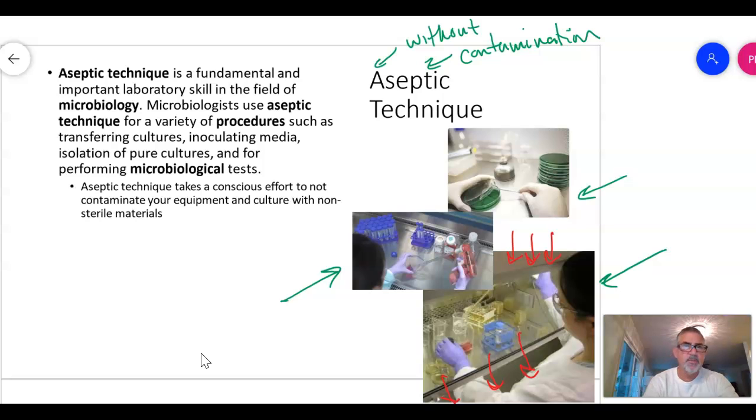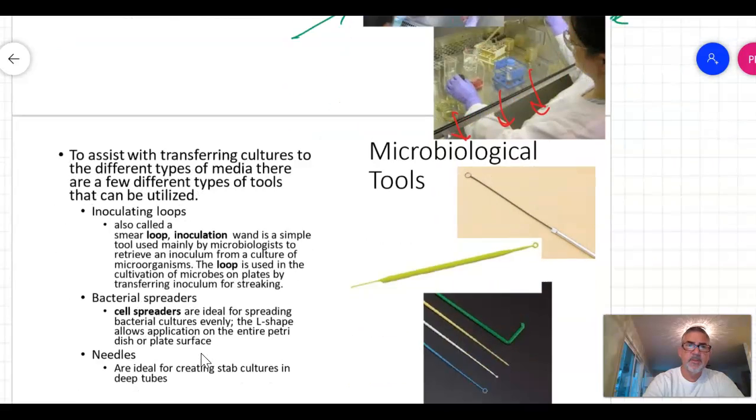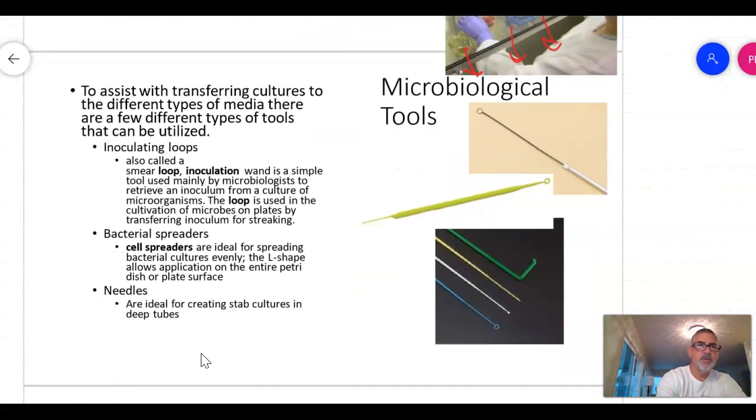So we have a whole bunch of things, but the important thing is that it takes conscious effort. Aseptic technique takes conscious effort. And we'll talk about that a little bit. So some of the tools we use, right? You need to know the tools.